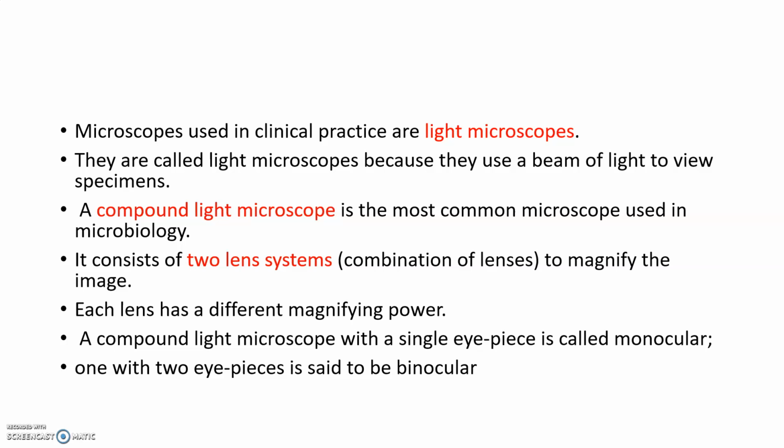is called a monocular microscope. The compound light microscope with 2 eyepieces is said to be a binocular microscope.